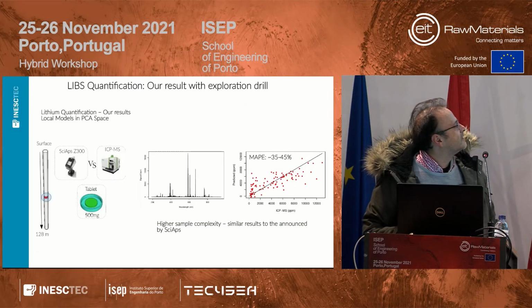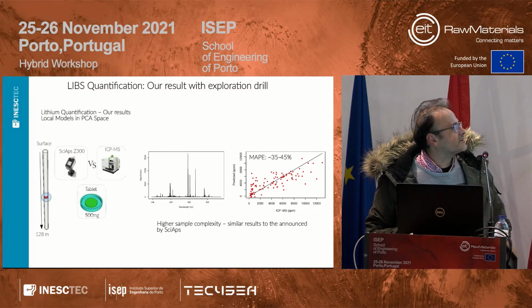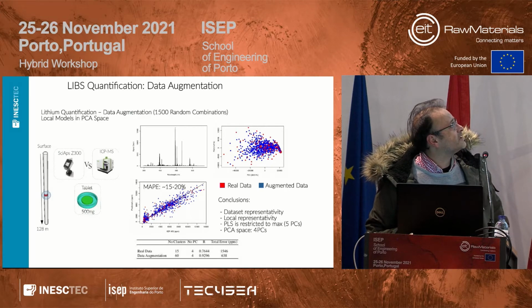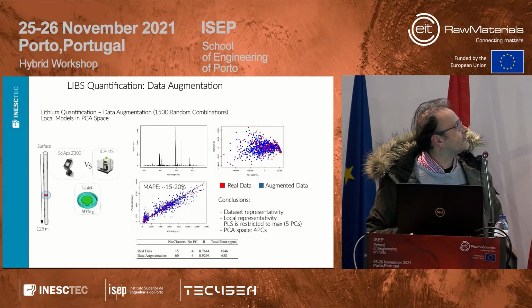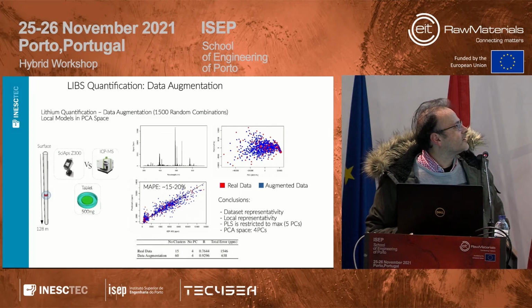So in here, I am using solely the data of the data set. This is before data augmentation. Of course, the result is not very good, only semi-quantitative, but you would have some quantification. But when you make random combinations of the spectra and the chemical composition, you can do data augmentation, and of course you start getting more accurate results because you are finding groups that have more covariance, consistent variance.